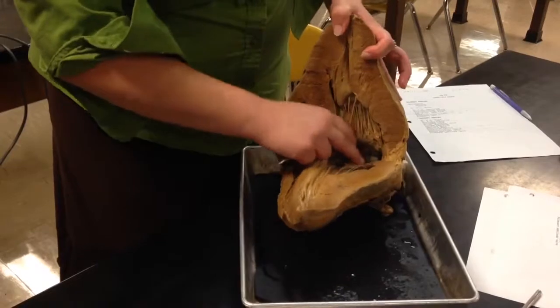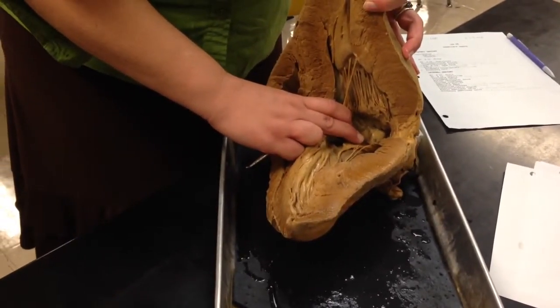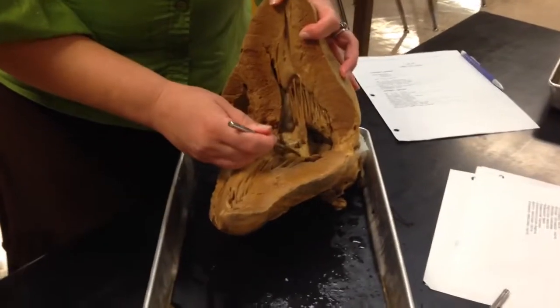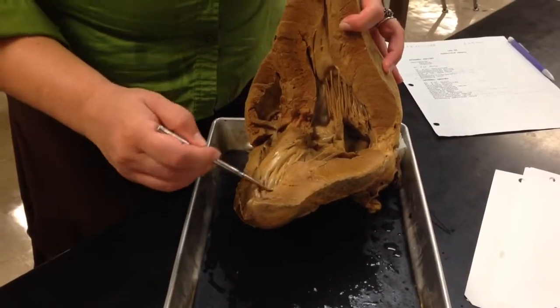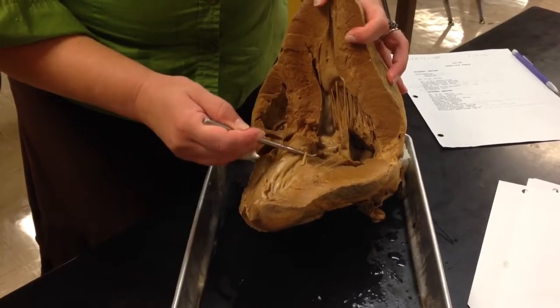And if you look inside the atrium, you can see those folds of the atrium. That's the pectinate muscle. This is the mitral valve. These are chordae tendineae. And then this that goes from wall to wall is trabeculae carneae.